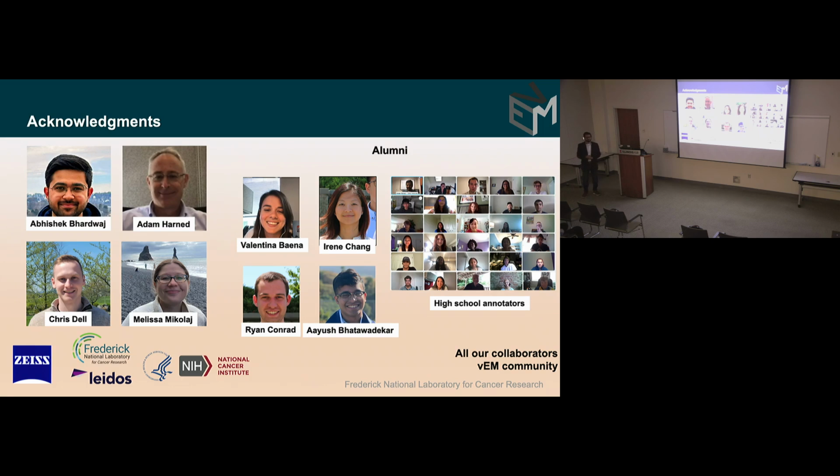And will Empanada work on non-mitochondria too? Yes. So with Empanada, we have used it for multilamellar bodies, for example. Other people have reported using it for cilia. There are some things for which it doesn't make sense, like ER, for example. There's no instance of ER in the cell, everything is one ER, right? So that's not very good.